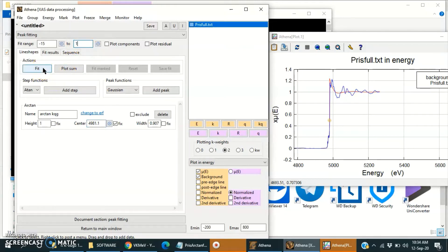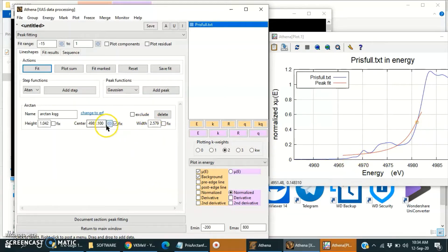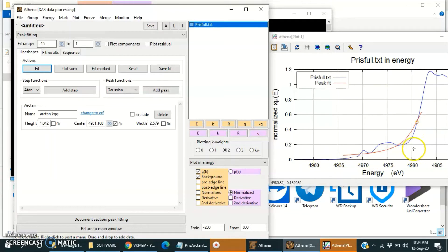Now click on Fit. The arc tangent function is going through this energy. Now we will change these three parameters to get a perfect arc tangent function which can go through the pre-edge line and then through this edge.